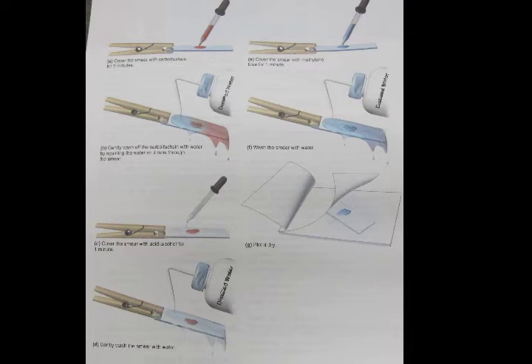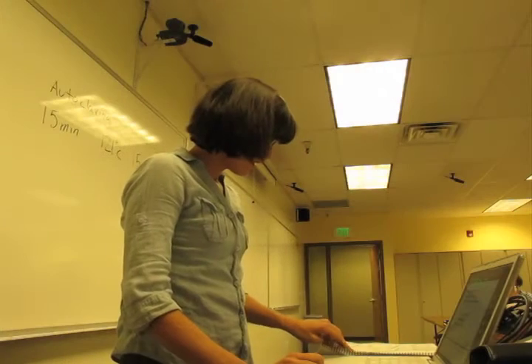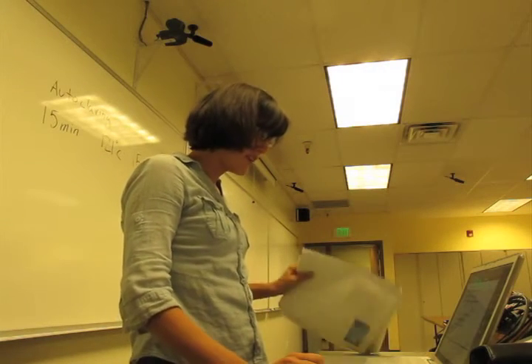Acid alcohol. Yeah, that's what it says in the bucket. Right, acid alcohol. And then what is the counter stain? Methylene blue. So it's a little bit shorter than the gram stain.